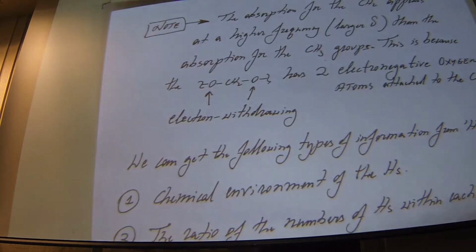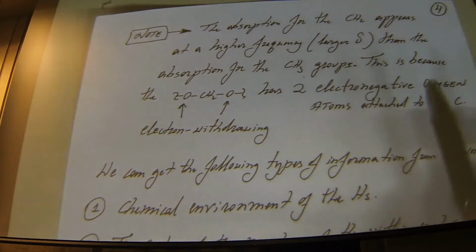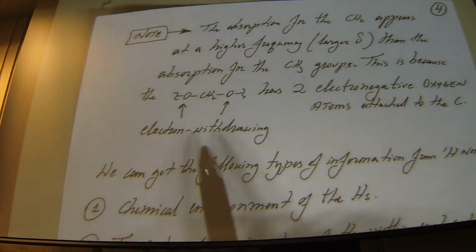The other thing I want you to notice is that the two peaks in that spectrum don't appear at the same frequency, so they don't appear at the same chemical shift. The chemical shift of the CH2 is appreciably different from the chemical shift for the methyls. In fact, they're separated by a mile. You'll notice that the CH2 appears at higher frequency than the CH3. That turns out to be very important.